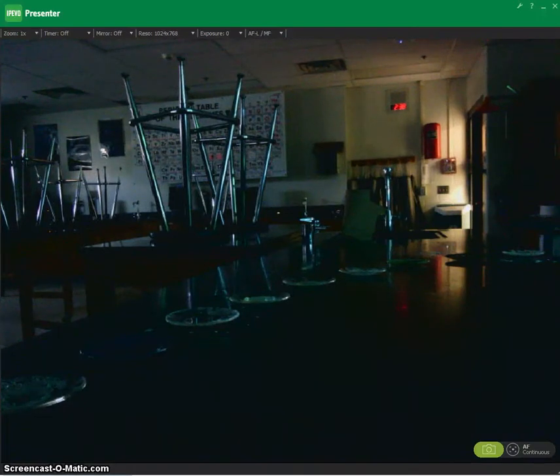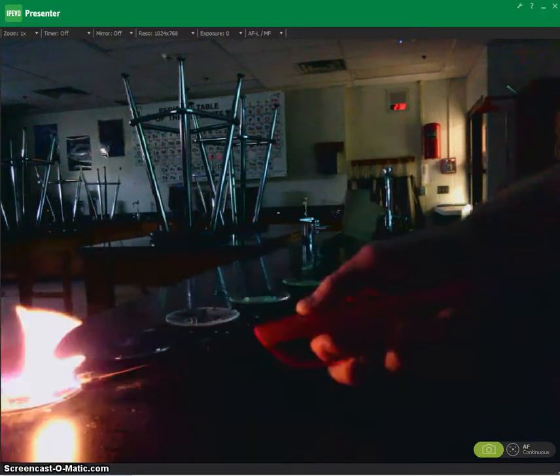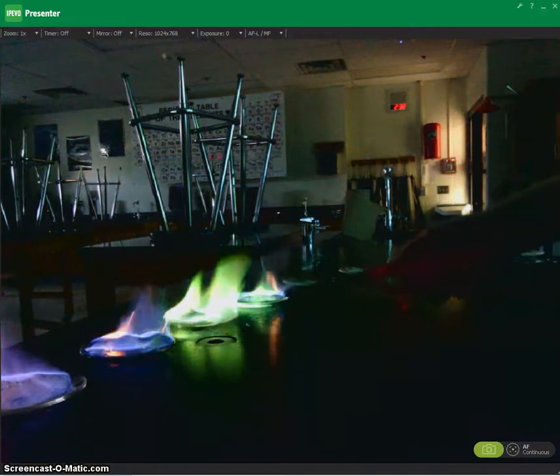Now, each salt will emit its own unique spectrum — just like individuals have their own fingerprint, each salt, or element, has its own color of light.